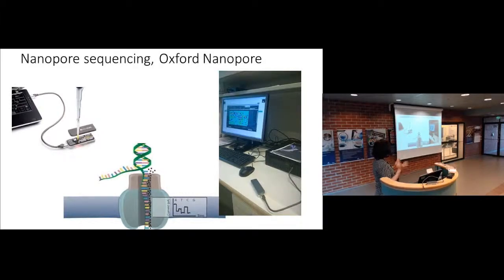With this, we are only interested in sequencing some very difficult genes. So if we amplify only certain genes, we can get the read coverage very high, so that we can sequence it thousands of times, and then we can see from the data where the sequencing errors are, and we can first make the consensus, correct the errors, and then align that consensus to the reference.